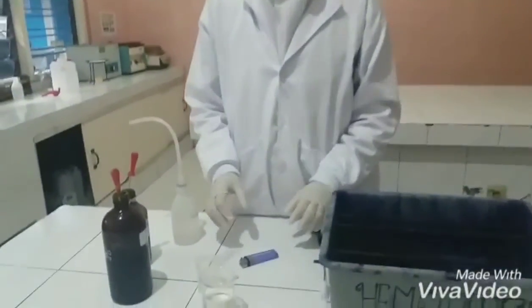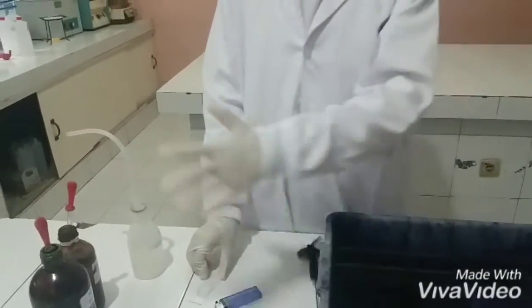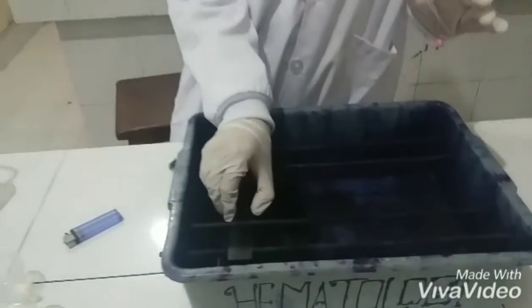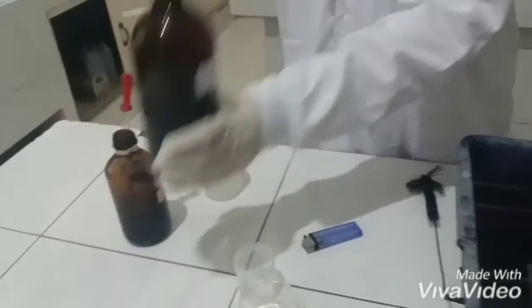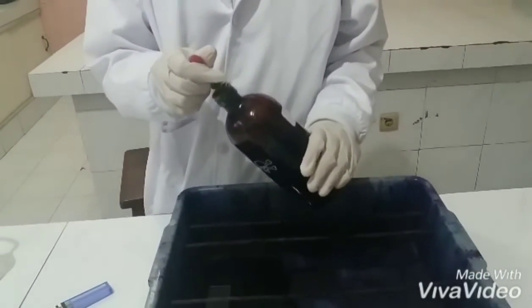Now I will practice acid fast staining with the Ziehl-Neelsen method. Firstly, we prepare all that we need, and then we take the preparat to the staining rack, like this. Add carbofuchsin over all of the preparat.